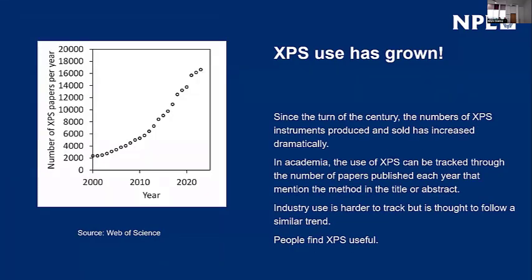So in the next part of the talk, I'm going to talk a little bit about XPS, and I'm going to contrast that with HAXPES, what's different or what's not different. And we'll see how that works.